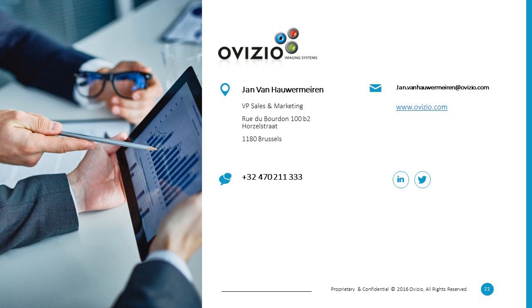Okay. And this is the final question we'll be asking. One of the key challenges in the cell therapy industry is scaling up production so many people can access the therapy. I understand that Inline F can only monitor one bioreactor at once. Are there any plans to facilitate higher scales, either monitoring more than one bioreactor at once or a next generation product that can monitor tens of bioreactors at once? As of now, it's indeed one-on-one.